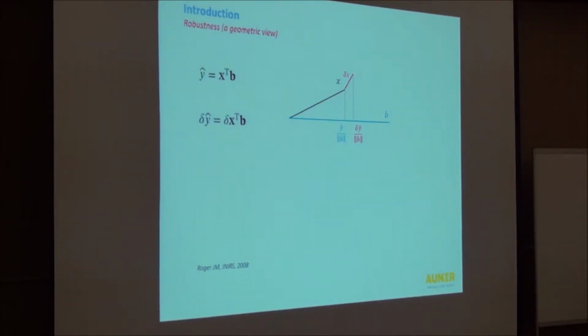But there is another solution, and that is to constrain the vector B so that it is orthogonal to that perturbation. So you rotate the B in a way that it becomes orthogonal, or at a 90-degree angle, to the direction of perturbation. And this way, no matter what the size of the perturbation, that will be corrected for. So you can approach a zero error with respect to that source of error, if you can come up with that sort of solution. So this is what the covariance filter does, to constrain B in a way that is orthogonal to the subspace of the perturbation.